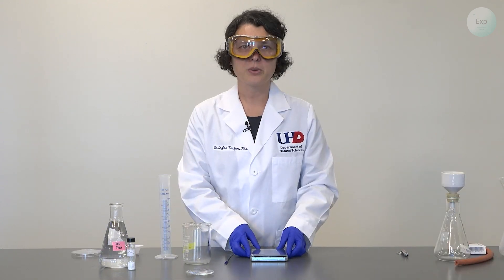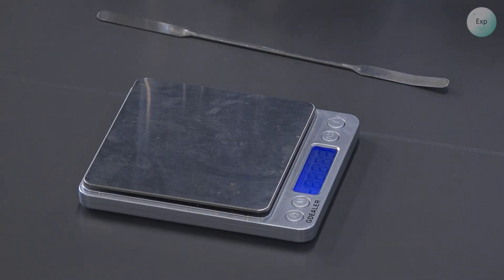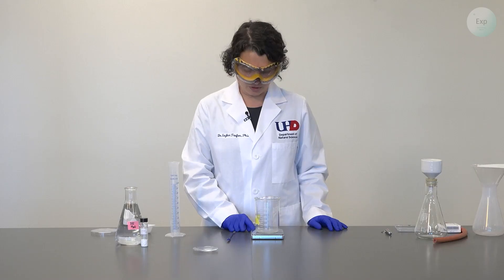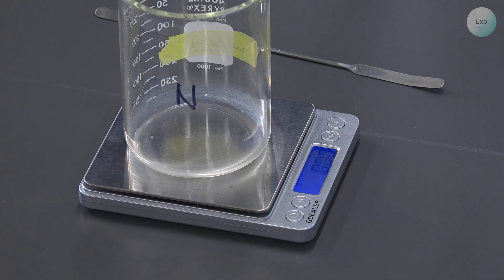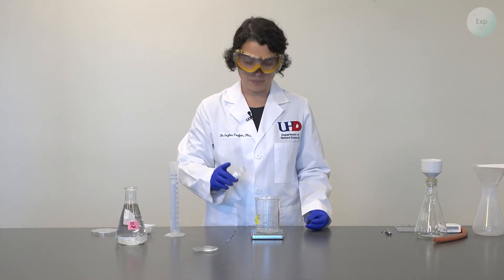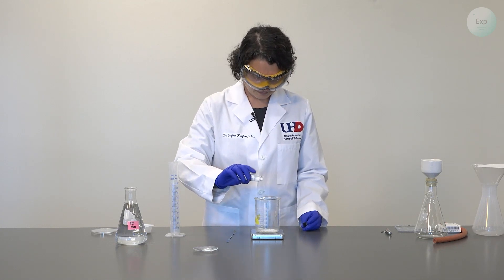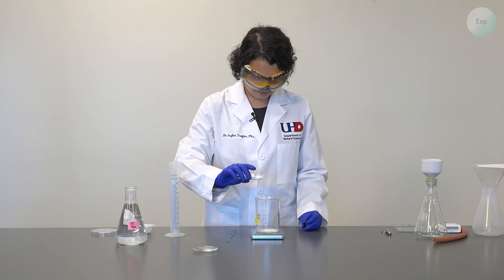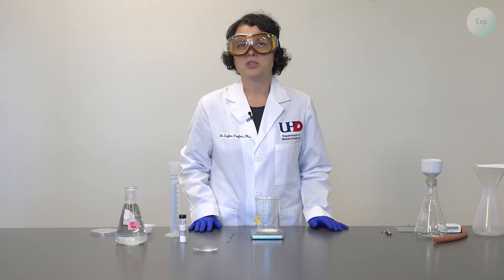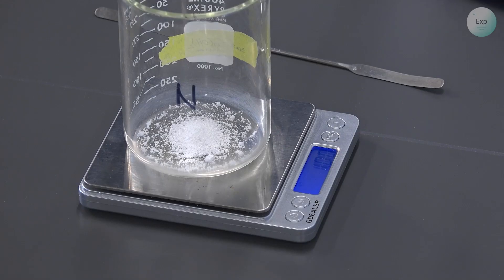First, we're going to measure out one gram of calcium hydroxide in a beaker. So I will turn on my scale and place a large beaker — I am using a 400 milliliter beaker for this experiment. I will tare it, and then I will use my calcium hydroxide and measure out one gram of it. I have exactly 1.00 grams, but if you measured a little bit more or a little bit less, that's okay. Just make sure that you record the exact amount that you weighed.